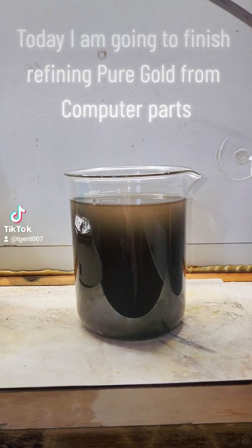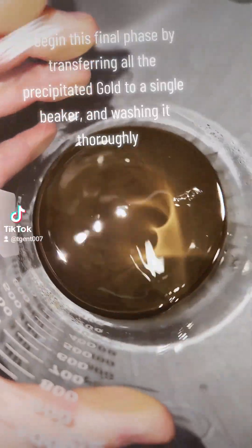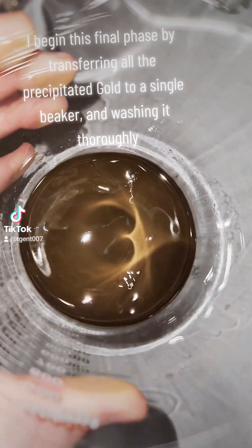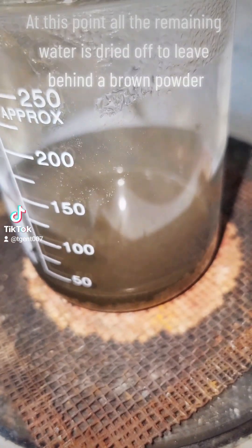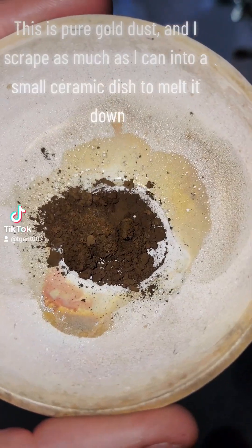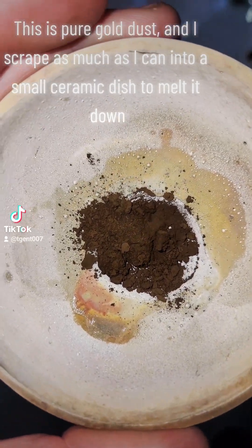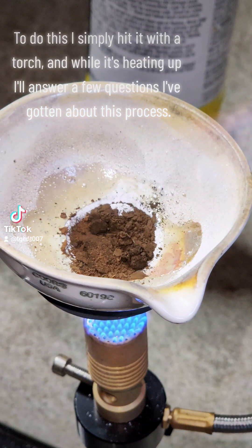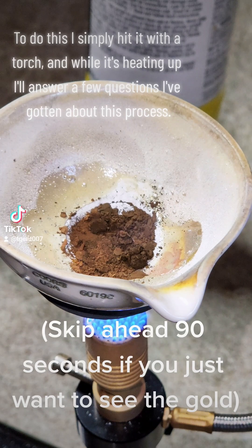Today I am going to finish refining pure gold from computer parts. I begin this final phase by transferring all the precipitated gold to a single beaker and washing it thoroughly. At this point all the remaining water is dried off to leave behind a brown powder. This is pure gold dust and I scrape as much as I can into a small ceramic dish to melt it down, simply hitting it with a torch.